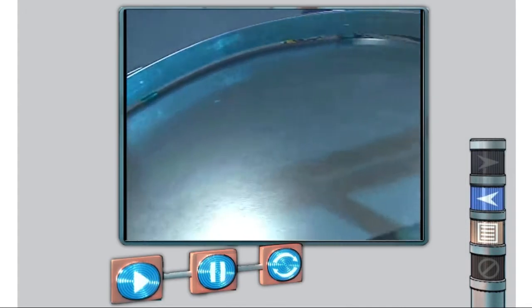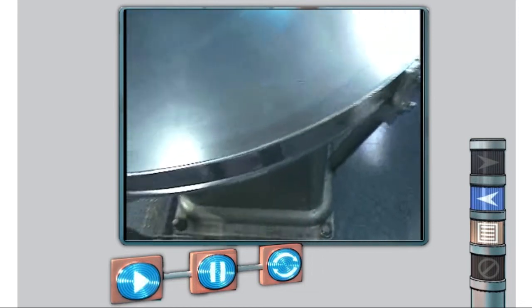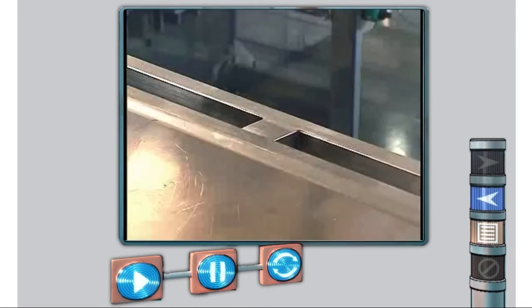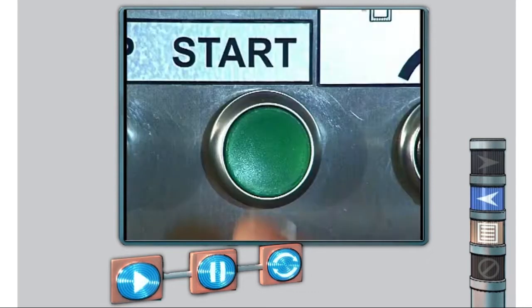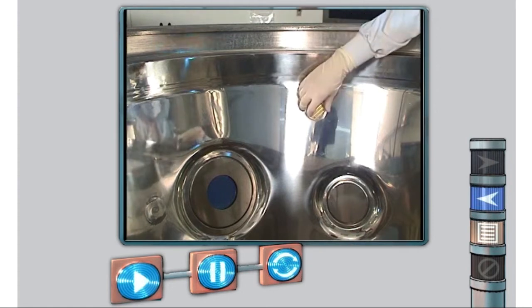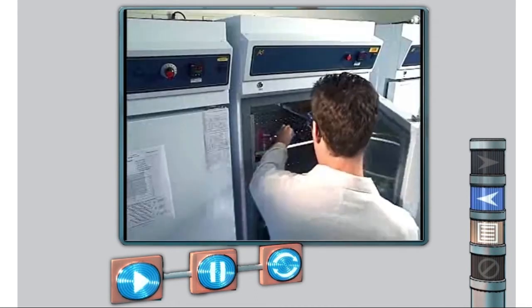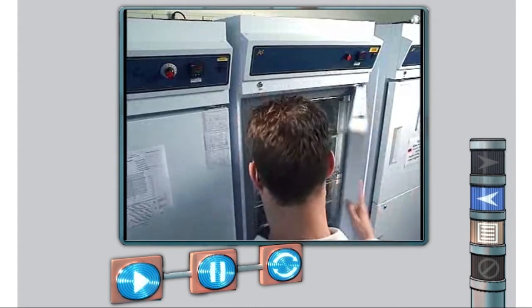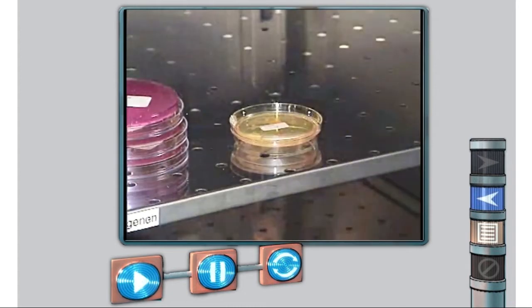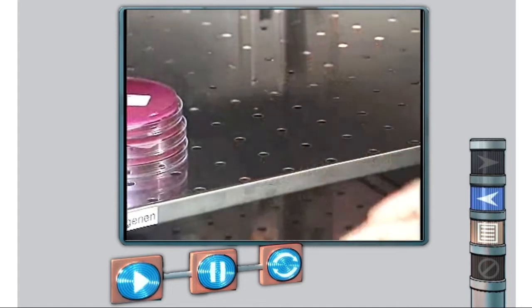It is not possible to detect microorganisms with the naked eye. They multiply in damp, warm and dark environments, for example in the pores of skin, under fingernails or in certain parts of equipment. If a nutrient medium is applied to a surface, bacteria will adhere to it. The nutrient medium is then placed in an incubator. After a few days, the microorganisms will have multiplied and can be recognized by the naked eye in the form of a colony of cells.